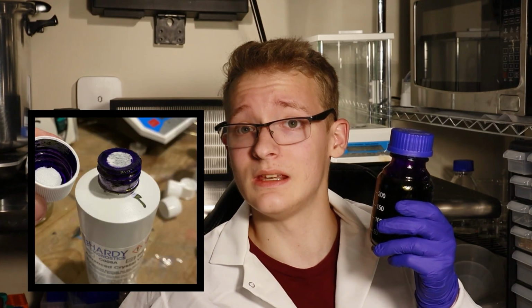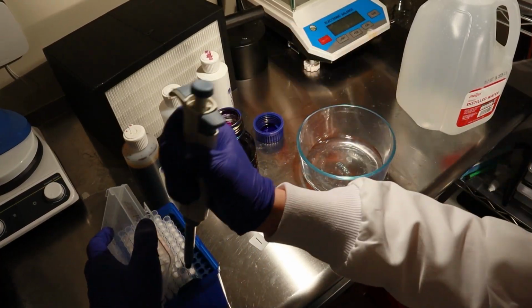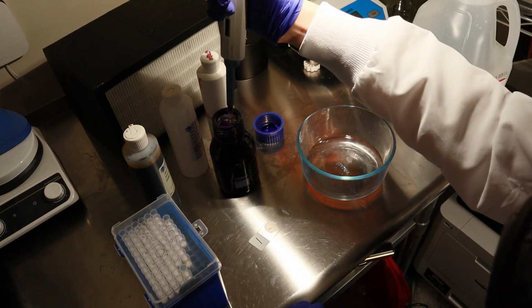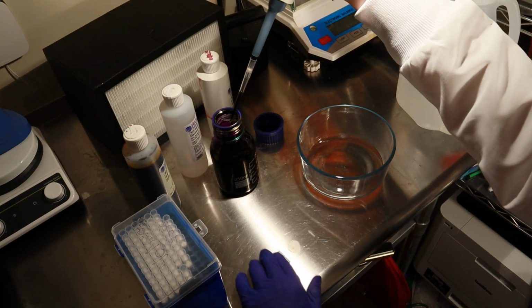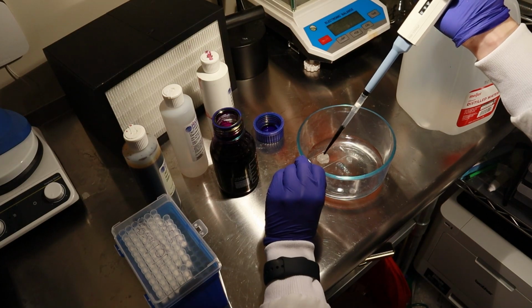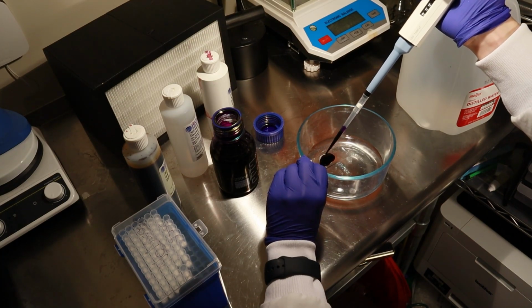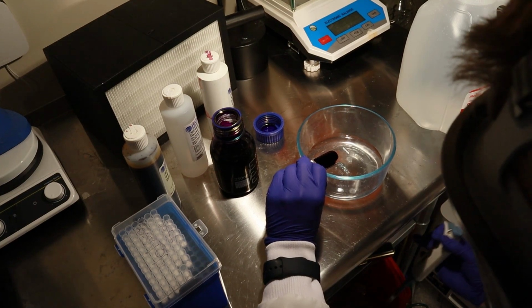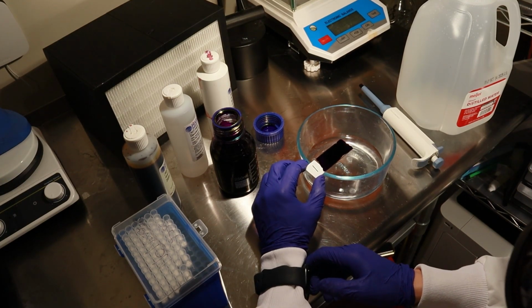Now my crystal violet, it's in a media bottle because when I received it, it was leaking. To start the stain, I took my micropipette, set it to 1 milliliter, and with a non-sterile 1 milliliter tip, I pipetted out 1 milliliter of crystal violet and added it to the slide, while holding the slide level just above a pool of water in the crystallization dish. I then ejected the purple tip into my trash and then set a 1-minute timer on my watch.